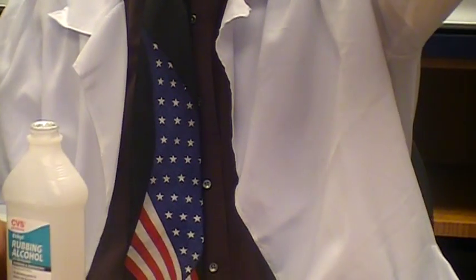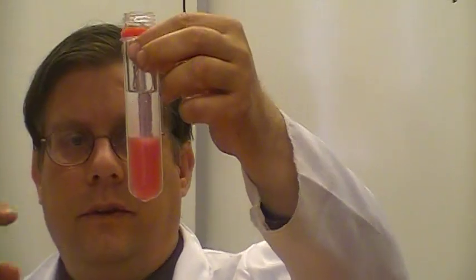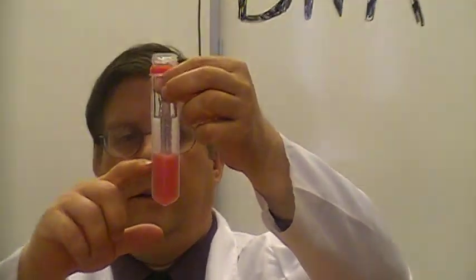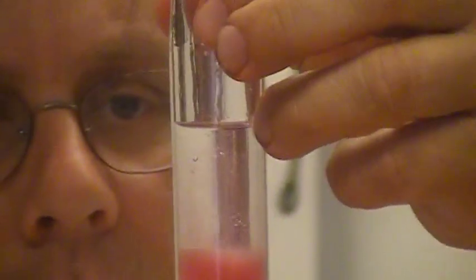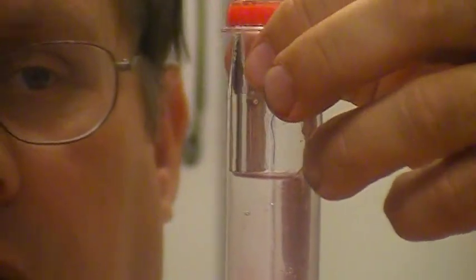So, now you have two layers, a layer of a strawberry lysis solution and a layer of alcohol. And what should start happening in a minute is you should see little cobwebs or little stringy gauze-like substances starting to form and that's the DNA. So, we'll keep a look on that.